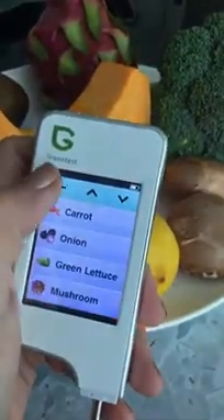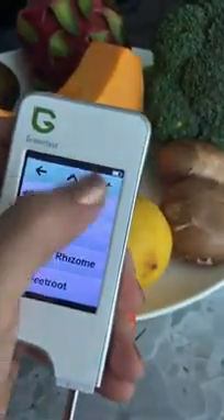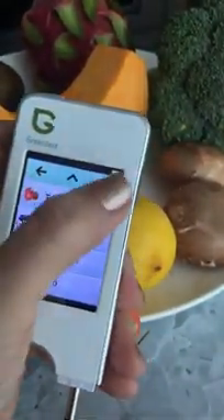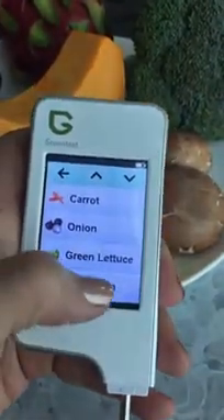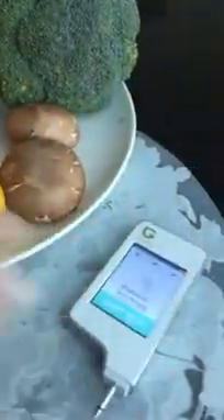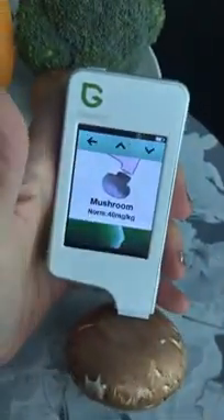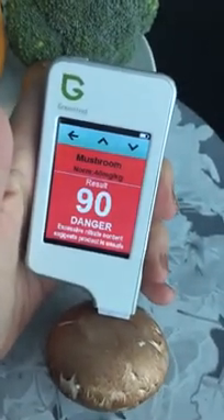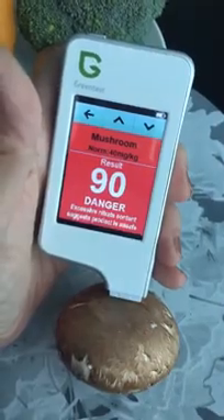Let's go back to the screen and test mushrooms. I've got some normal brown mushrooms from a supermarket. There we go — mushroom selected. Let's hit start. Oh no, it says danger too! This is also non-organic mushroom. Yikes! So are you convinced yet to spend a little more for organic?